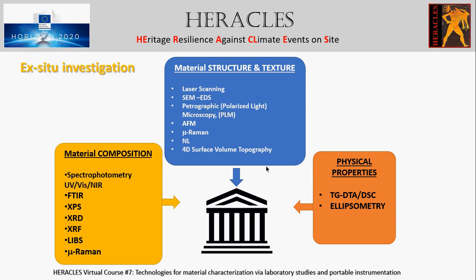It is a high-resolution analytical technique, since sampling is performed upon irradiation of the material with a strongly focused laser beam forming a spot of approximately 200 micrometers in diameter and has 20 to 30 micrometers penetration depth. Almost 0.1 micrograms of mass is removed per laser pulse.